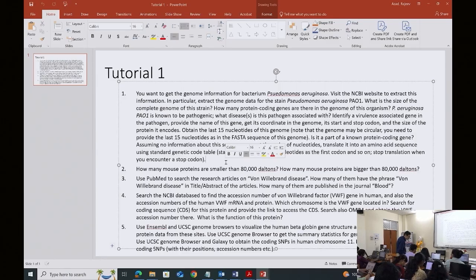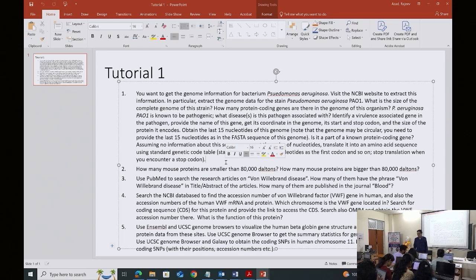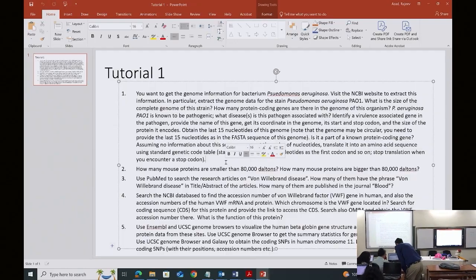At the end. Yeah. Like that. Yes, like this. Yeah, it is showing. So it is the same. It will be the same. Can you show, Gaurav? And I think Shravani, yours is complete. So go down, and it will be the genome sequence.